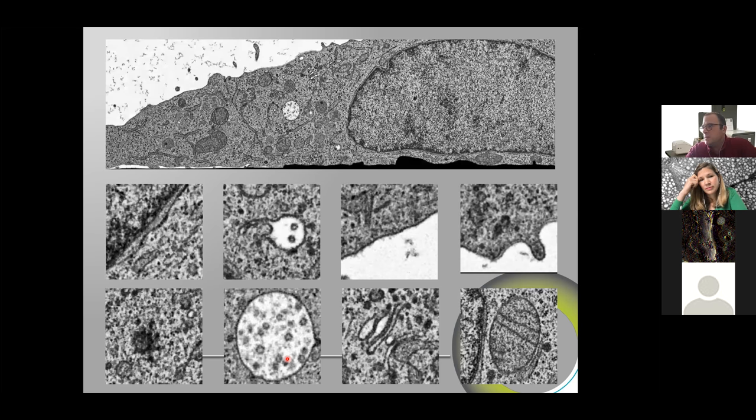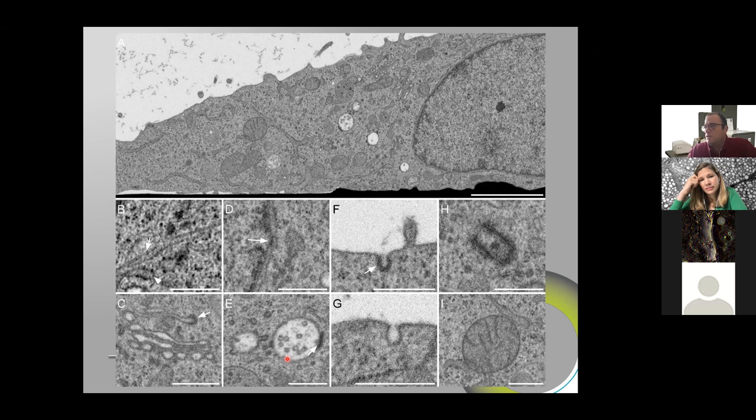And this is the same image without jumping. As you can see, we see the nuclear pore complexes. We see the coat under the endocytic vesicles, the coat at the endosomes, the Golgi and the COPI coating. So all of this is very sharp, and this was encouraging to us.